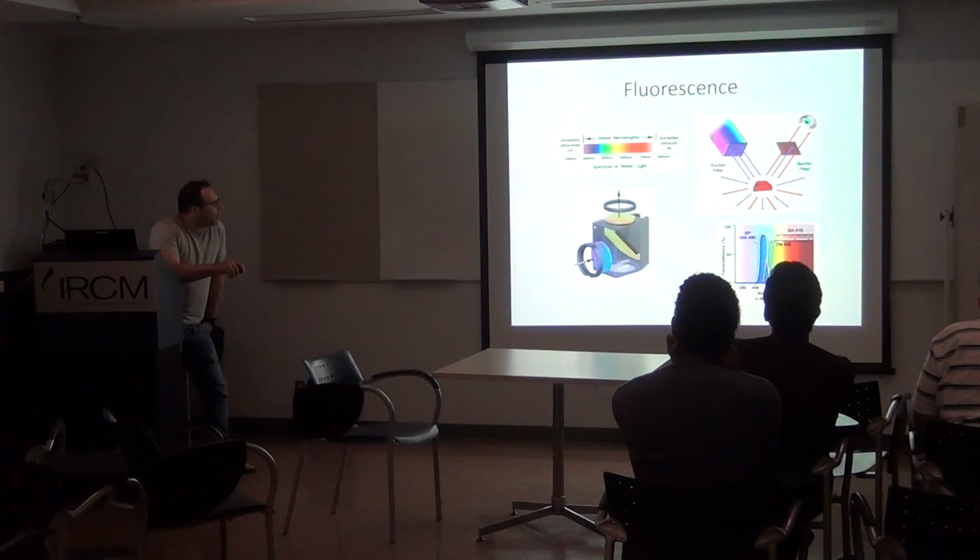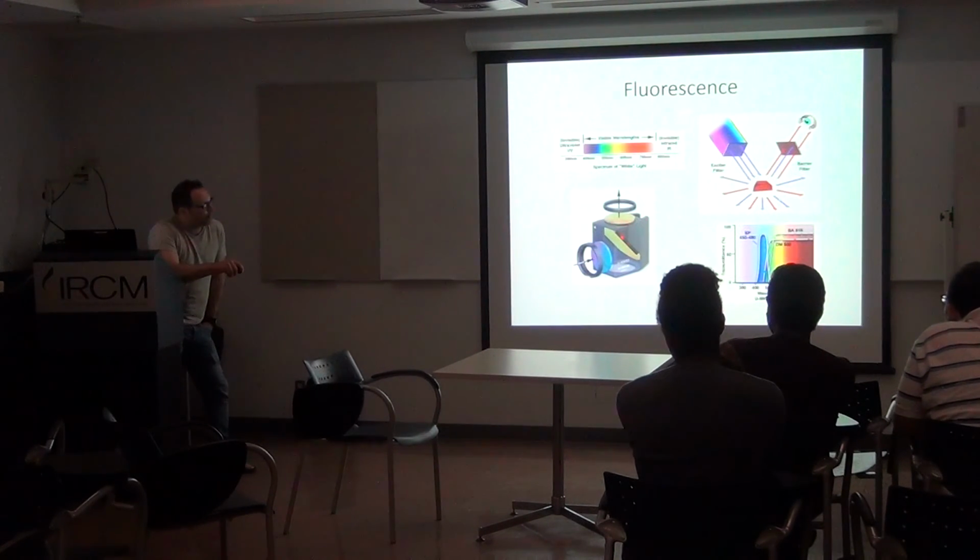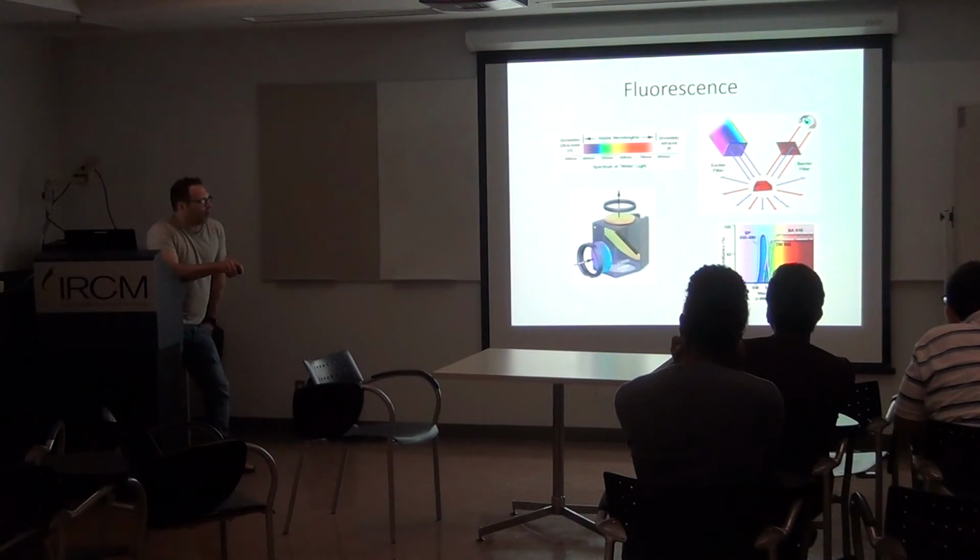And now we're with the fluorescence. So basically you have what's called an excitation filter, and you have an emission filter. And in between you have the dichroic. And if you look at the transmittance graph, so transmitted is what percent it transmits light.